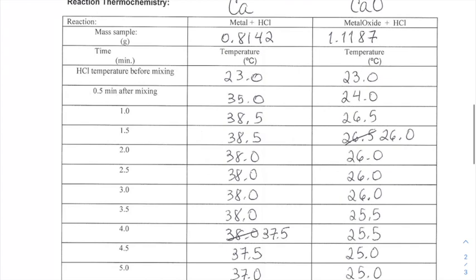Here is part 2, so this is what you would have done on day 2. In class, I would have given you calcium for your metal and calcium oxide for your metal oxide. Importantly, this right here is the mass of calcium only. It's kind of confusing because above it says metal plus HCl. That metal plus HCl is just telling you that's the reaction that it is.